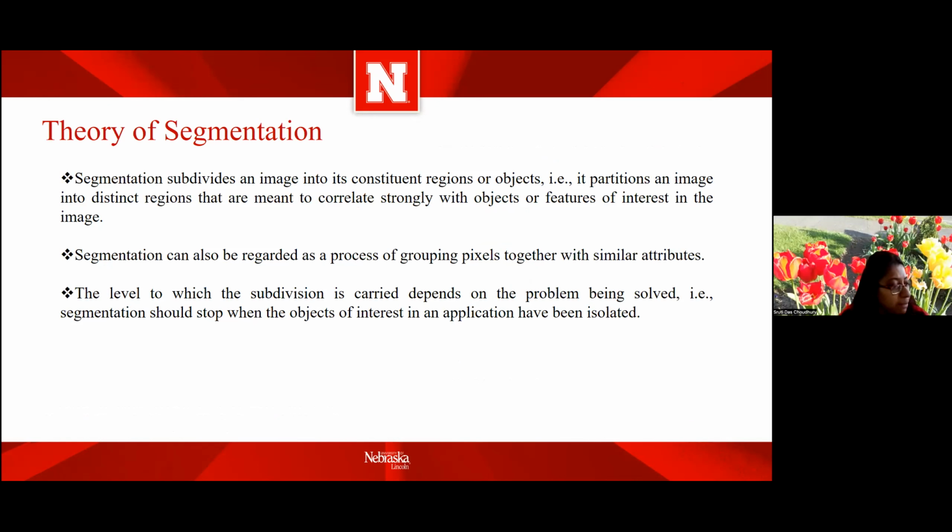The image captures all objects in the field of view. However, only one or a few objects are of interest to us. Separating these objects from the rest is a key computer vision challenge. An object exhibits many common characteristic features that can be used to isolate it.